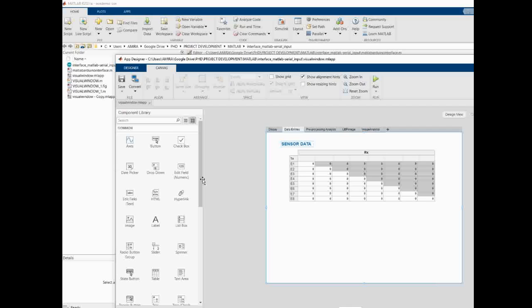I know it seems like I made big steps, but I think it's good that I arrange the things that I should do. So I know that I should start with the sensor data, because at the end I still need to display the sensor data in MATLAB.